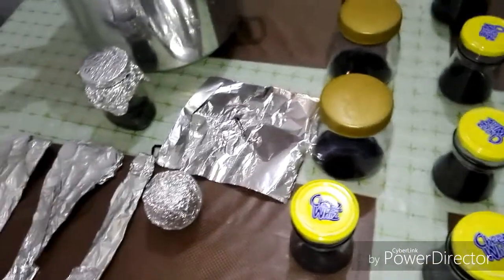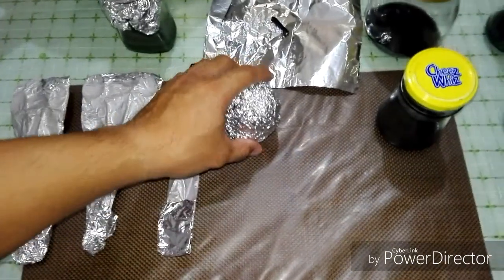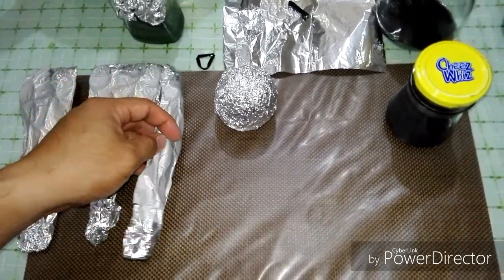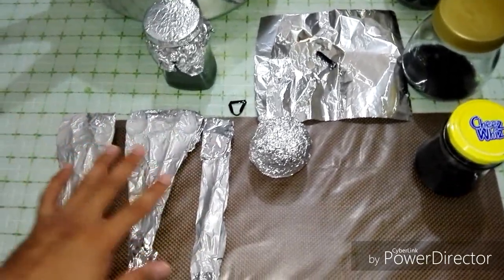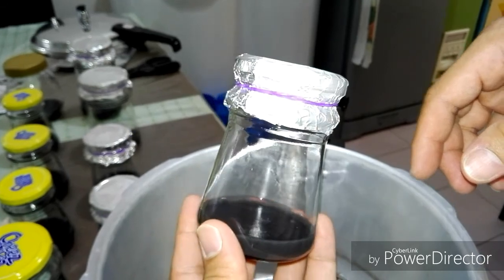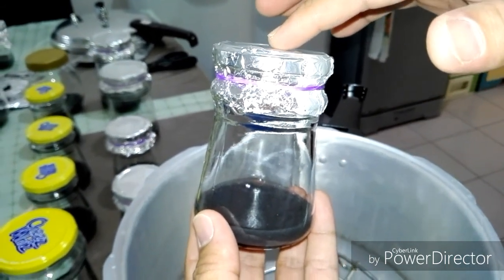I will also put my tools inside — my forceps right here, my petri dish, and the toothbrush that I used to scrub the seed bud. Now that the flask is already covered with the aluminum foil on top, it is ready for the sterilization process.